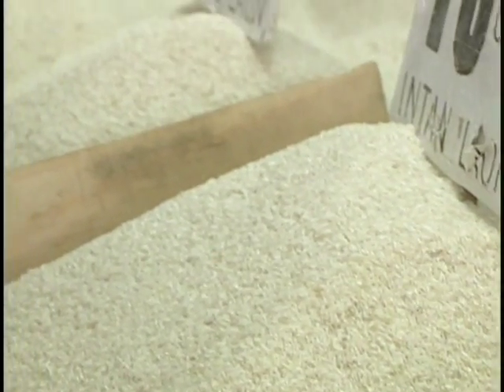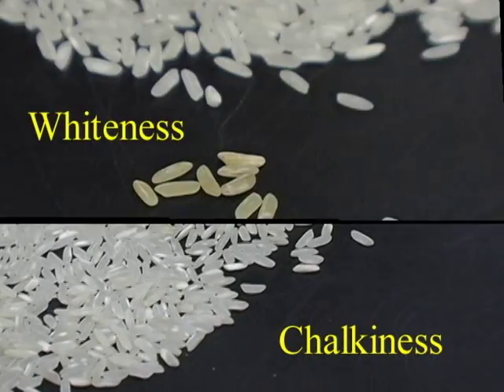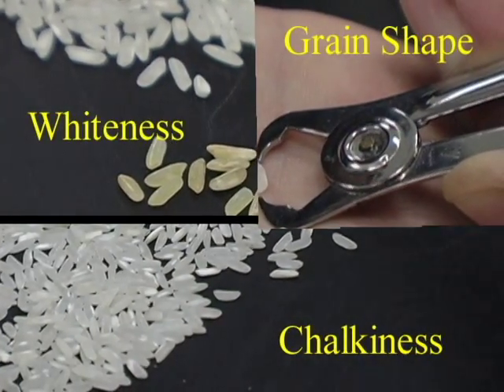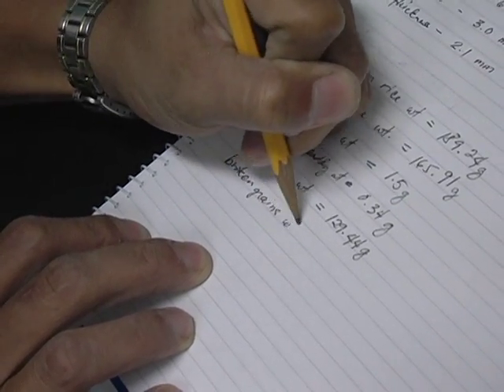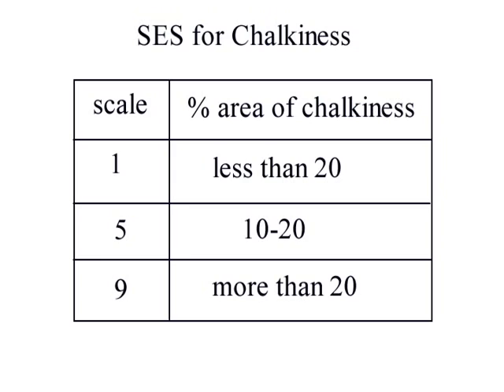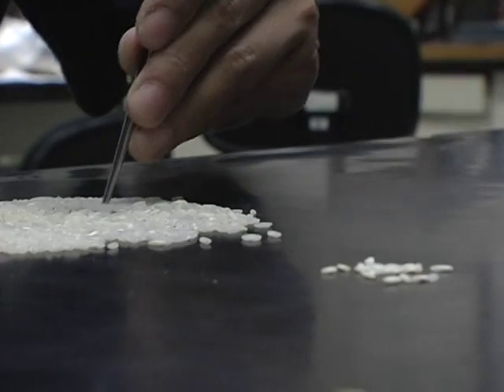In many markets, other quality traits such as chalkiness, whiteness, and grain shape affect the price of white rice. Now let's learn how to measure each of these properties in detail. A visual rating of the chalky proportion of the grain based on the standard evaluation system scale is used to measure chalkiness.